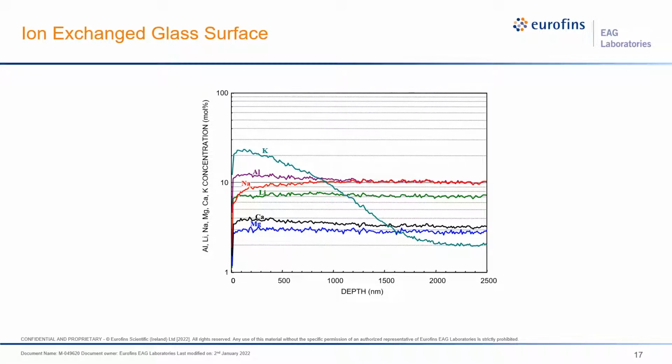And you almost always need a SIMS analysis to measure the depth of penetration of the potassium and its concentration gradient from the surface, from atom percent to parts per million concentrations, as well as the depth of change in the composition in the alkalis. And notice that there has been no change in other elements.